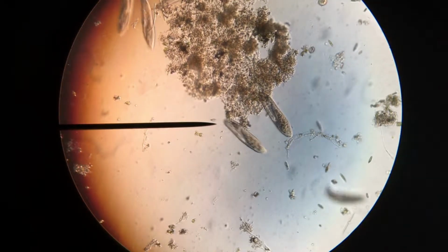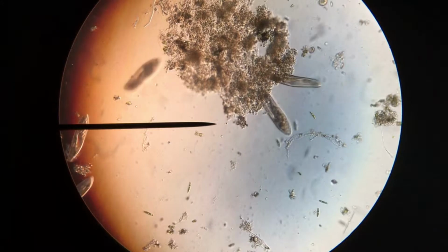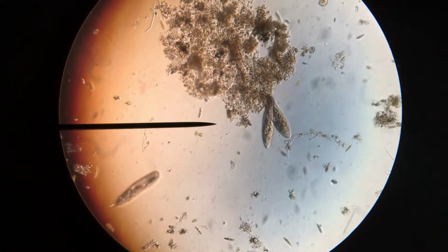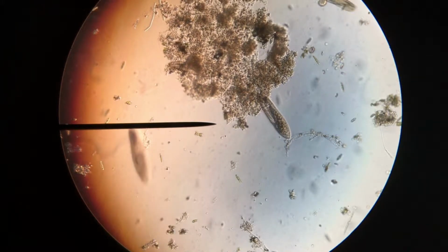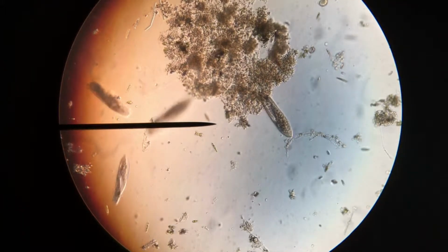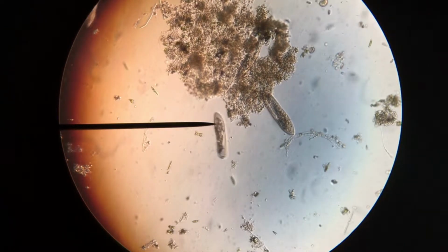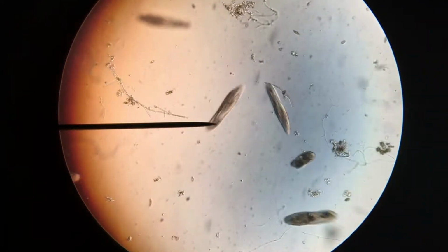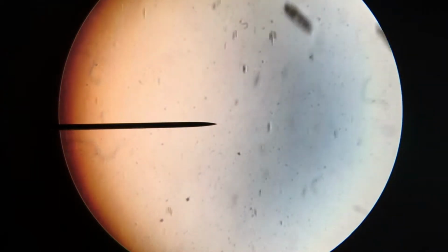So what you're looking for here are types of organisms and categories. Don't worry too much about exact species. And you're looking for relative abundance. So I'm going to give you a couple minutes here to take a look. I'll move around in the sample. You can turn down the audio if you don't want to hear my patter. I might identify a few things. But this will just let you take a look at what was to be seen at the bottom of your mini pond.